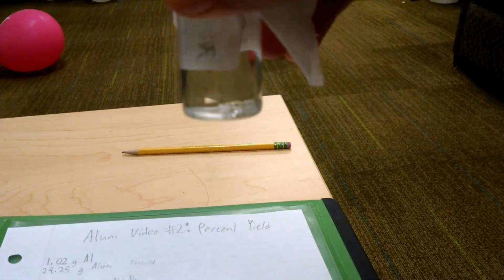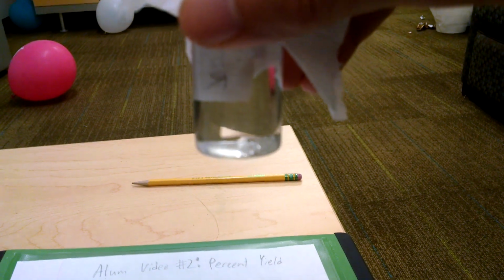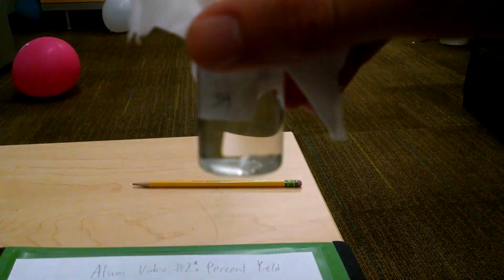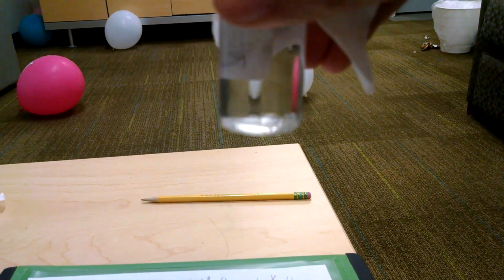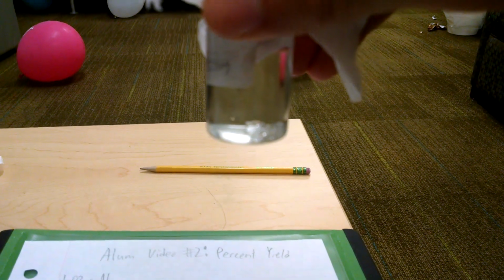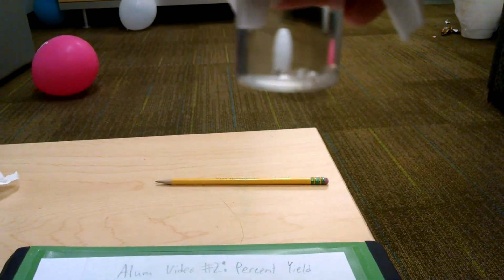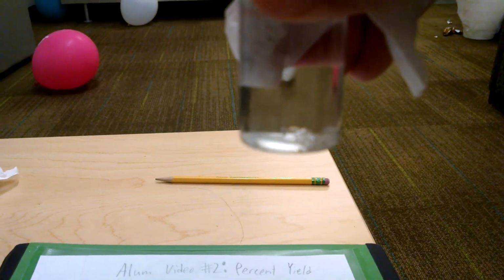The way these crystals are forming more specifically is, now that a small crystal has formed, it's easier for other crystals to form onto that through the process of seeding. There's a site that they can all grow on top of, and that makes it easier for more crystals to form, and so they're forming larger, more structured crystalline structures.